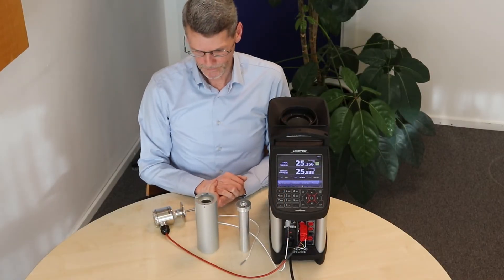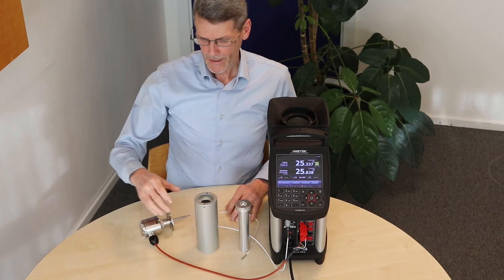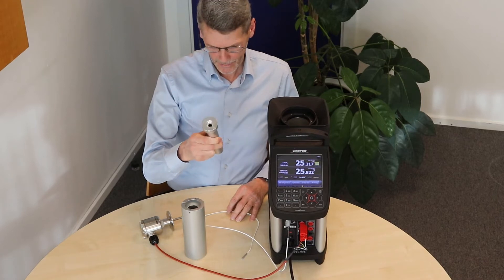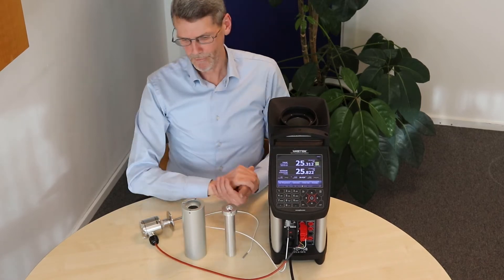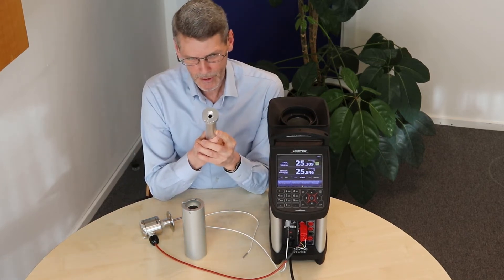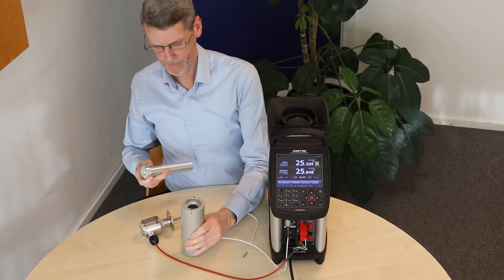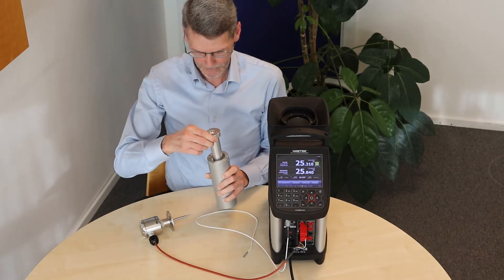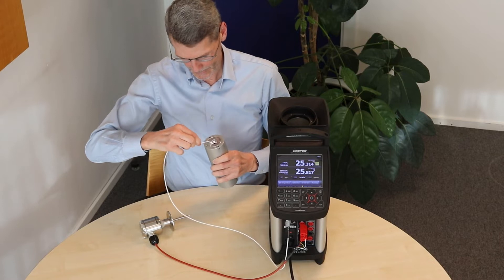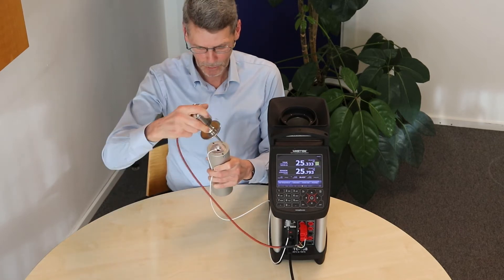Method number two: calibrating a sanitary sensor dry in an adapter together with an RTC 156 clamp insert. This is also a very simple setup. For users of the RTC 156, you can reuse your clamp sensor. This clamp sensor fits directly into a special adapter, and then you mount your reference sensor — always at the same depth as the sensor that you are going to test.